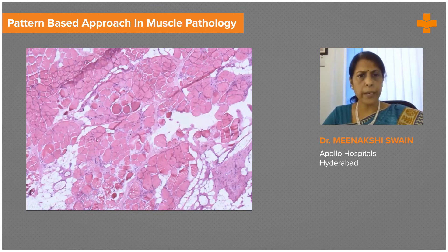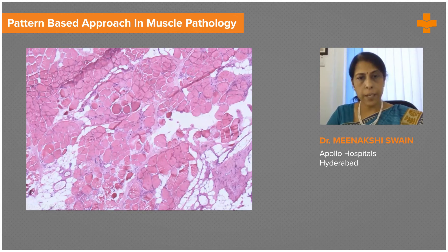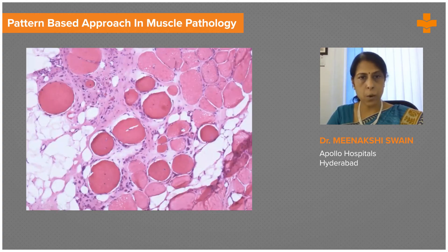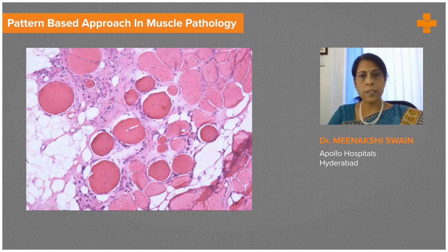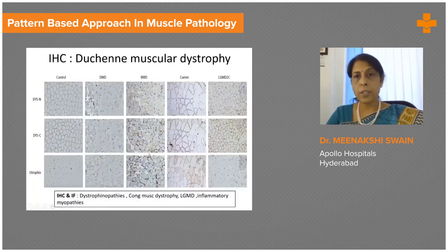This is the biopsy of a five-year-old child who had hypertrophic calf muscles and a very high creatine phosphokinase — CPK levels were in the thousands. The low-power view shows destruction of fascicular architecture with a lot of fat and fibrosis. At higher magnification there is extreme variation in fiber size, a lot of fibrous tissue, fat infiltration, rounded or hyalinized fibers, and some splitting. This big fiber has actually split across the center — a split fiber. There are also fibers with central nuclei. This myopathy with so much fibrosis is equivalent to a dystrophy.